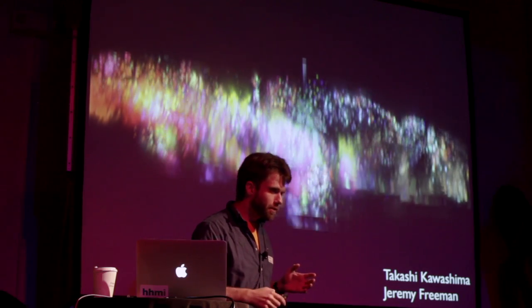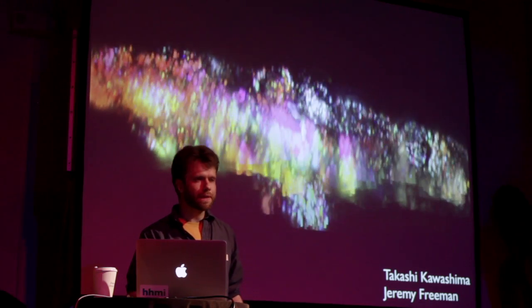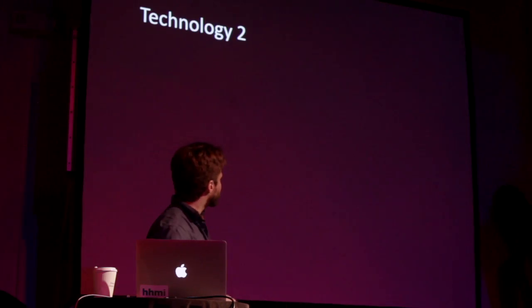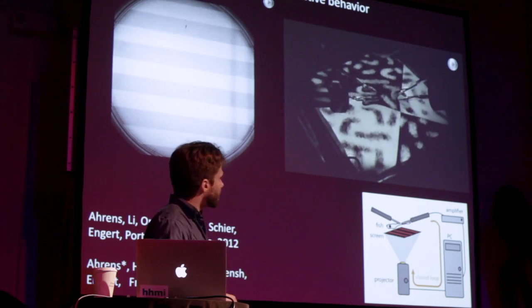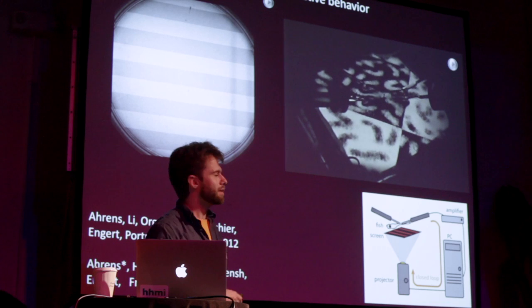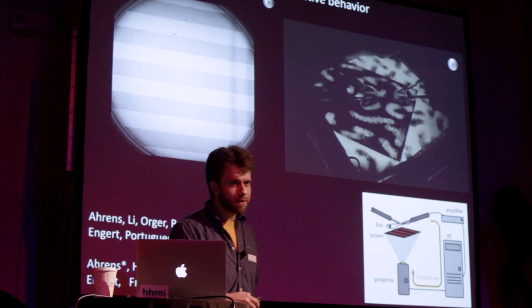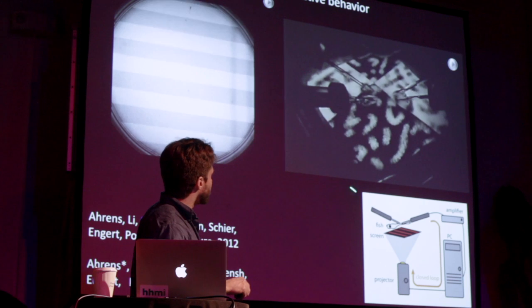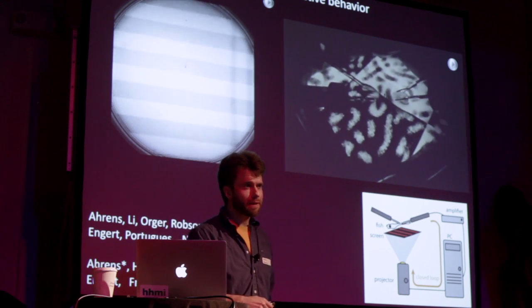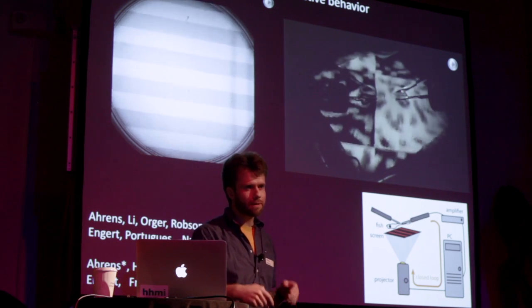Now, we wanted to not only do imaging of a passive animal, but we actually wanted to have behaving animals in order to really make sense of the role of the brain in behavior. So now we come to the second piece of technology. Here we developed a way to image the brains of behaving animals, or fictively behaving animals. So here's an animal doing a freely swimming behavior, it's just swimming in a dish. What they do in response to whole field motion is they swim along with it. This is called the optomotor response. This is this behavior recapitulated in a paralyzed animal. The way this works is we paralyze the animal, we record electrical activity in the tail coming from the spinal cord projecting to the muscles.